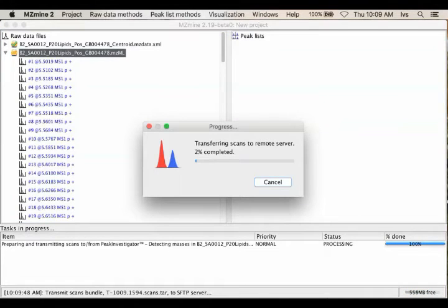We hit OK and the job starts uploading to the Veritomics servers. Note, while the files are being uploaded, you still have an opportunity to cancel the job. No job will be started until all the data is received by the server. However, once the transmission is complete, the job will be processed and your account debited accordingly.